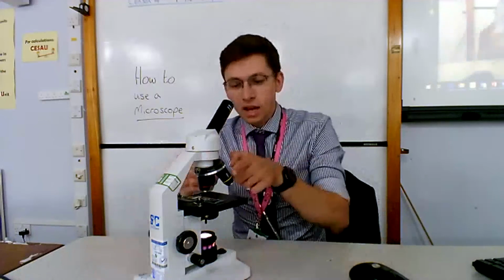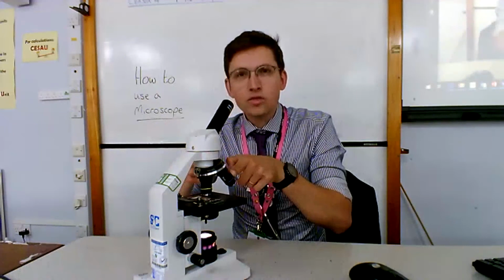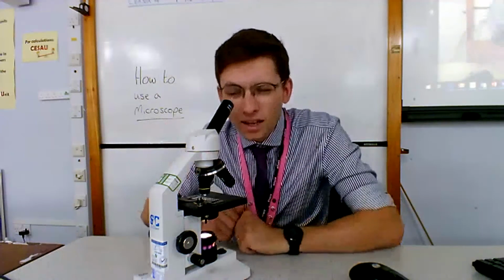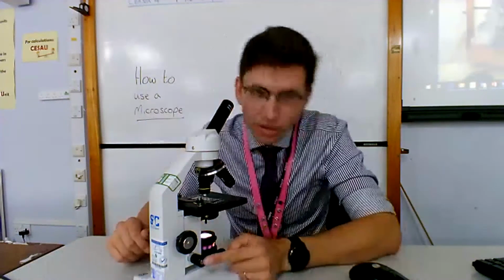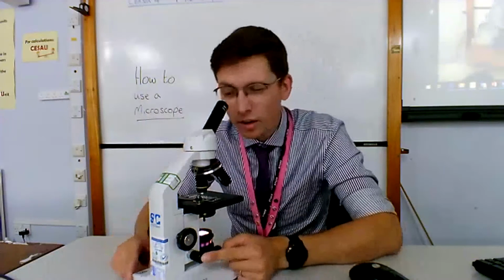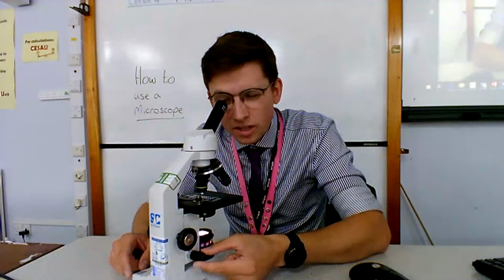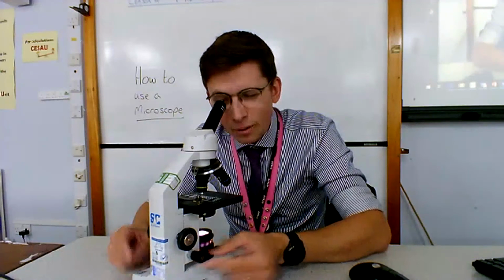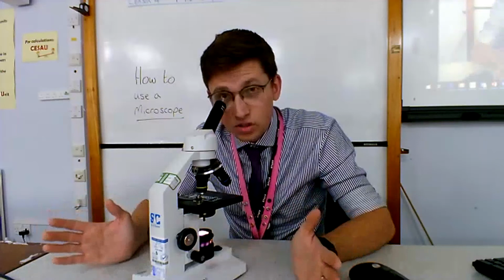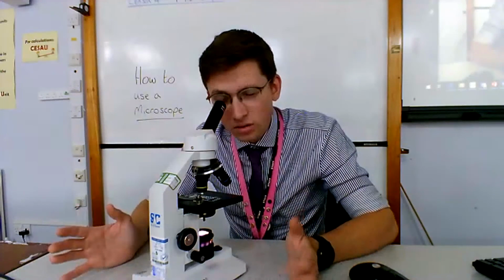Okay, once I've got that, I'm not going to touch anything apart from my objective lenses. I'm going to increase the power of my lenses. So now I'm seeing in a much higher magnification, but the focus is just a little bit off. So I'm now going to use my fine wheel just to fine tune and get my picture back. Let's find it. There it is. Now, at this, I can see individual cells. I can see individual nuclei that are in the cells.